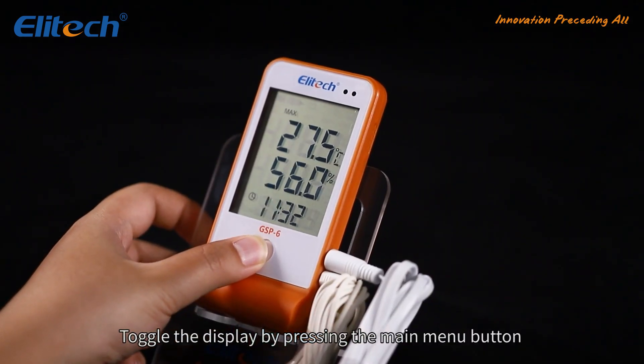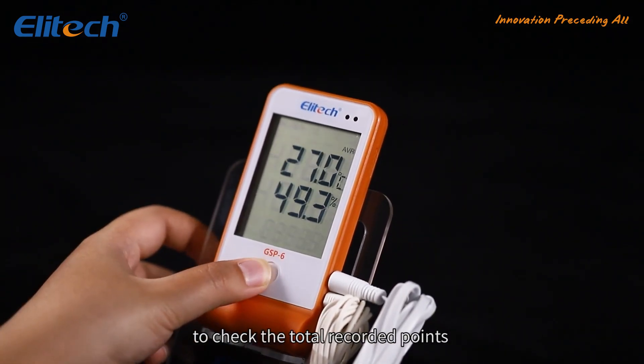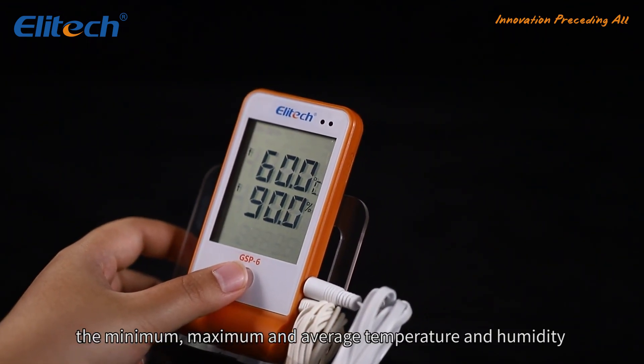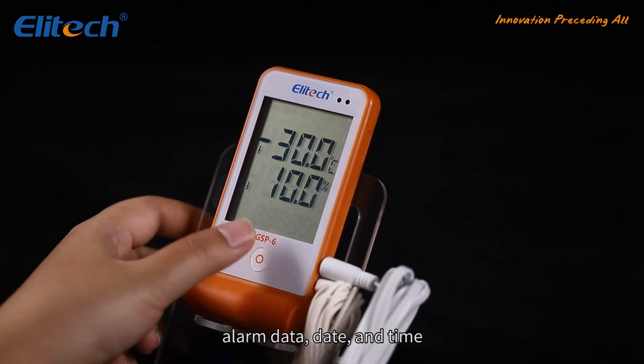Toggle the display by pressing the main menu button to check the total recorded points, the minimum, maximum, and average temperature and humidity, alarm, data, date, and time.